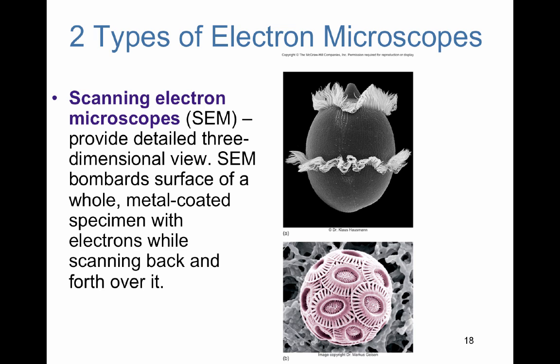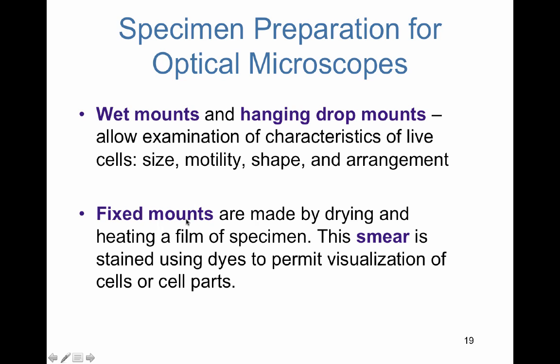All right, so we have light microscopy and electron microscopy, two major methods that you should remember. Now, when you are ready to observe a specimen under the microscope, a lot of times you have to prepare it in a way where it is stained or preserved, and in this method you end up killing the cells, but for some of these cells you need to preserve them.